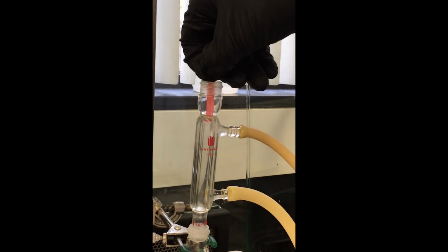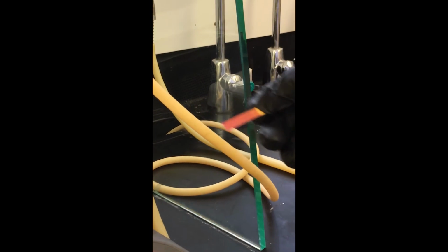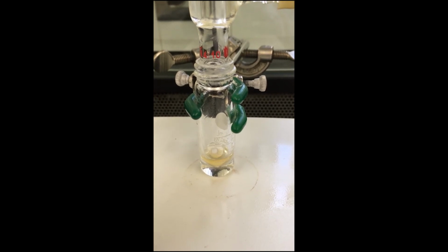Additionally, to demonstrate the reaction is happening, we can actually test, because the sulfolene should be releasing sulfur dioxide vapors as it breaks down to release the butadiene. We can test that by taking a damp pH paper and inserting it in here. And as you can see, it turns red, indicating that the SO2 vapors are being generated, so the reaction is progressing. So now, all right, our hour-long reflux has just finished.